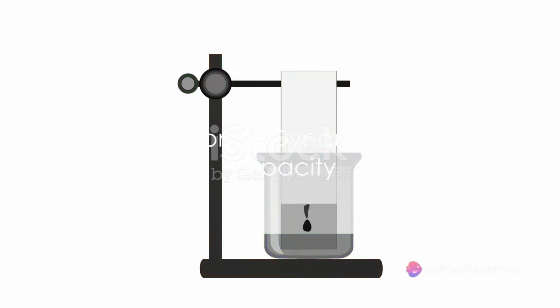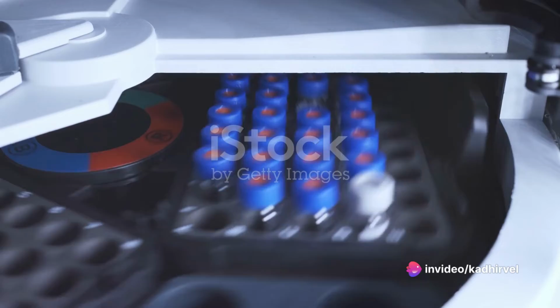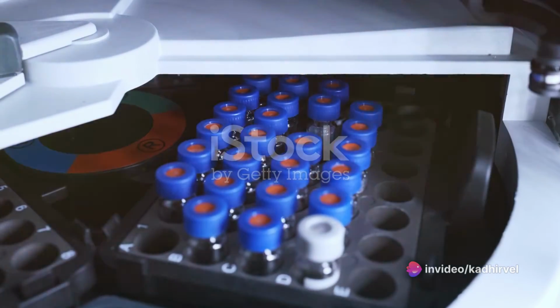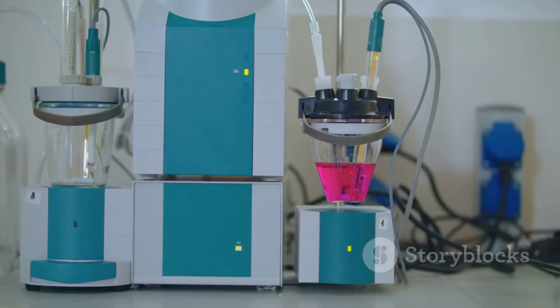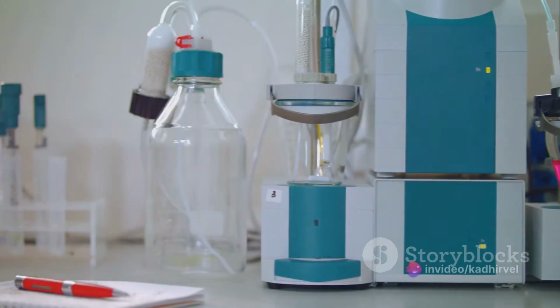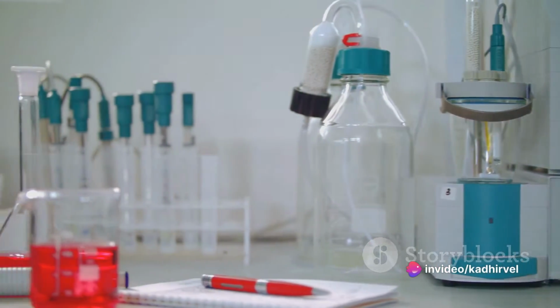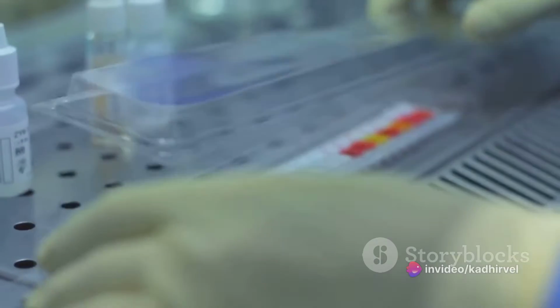Have you ever wondered, what is the maximum amount of solute that can be loaded onto a chromatography column? That's where dynamic binding capacity, or DBC, comes into play. Dynamic binding capacity is a crucial parameter in chromatography, especially when purifying biomolecules such as proteins, antibodies, and nucleic acids.